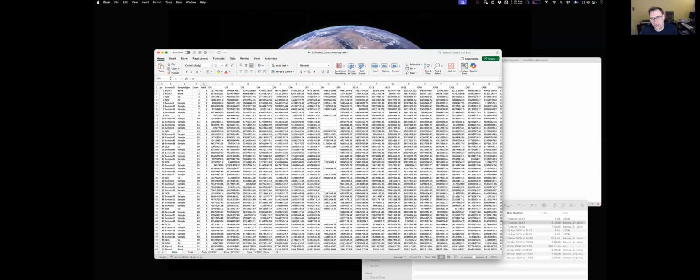But this is what I mean about every instrument and lab combination needing to go in and use the algorithm and see what the data looks like. Because if you've got extremely linear data, which if I'd showed you the Metabolon data, you'd see how linear it is, there's no need to do nonlinear correction because it's so linear. It's almost flat. You don't really need to do the algorithm at all.